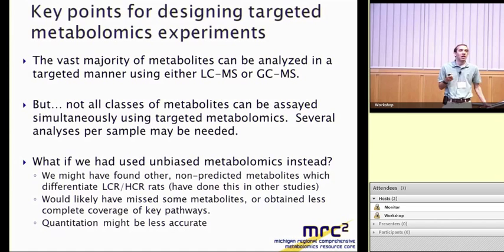The good thing is that once we're done with that, we have a relatively complete picture of what's going on in all of those pathways. We're not missing much in terms of particular intermediates. So that does increase your time. In some senses, you have to go back, look at your data, understand where you're going, but it leads you in a sequential direction to tell you what's important to look at next.